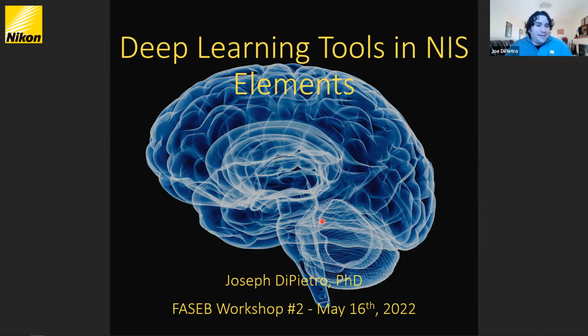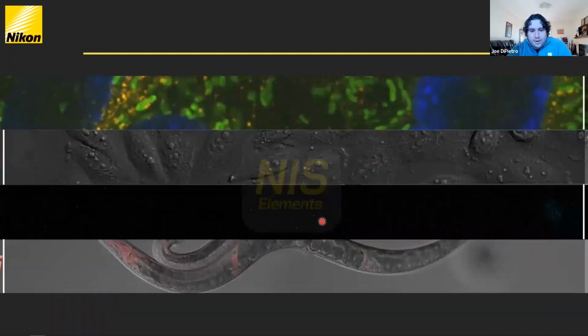All a large image is a bunch of small images. So if you just keep it as the small images, then you can do the analysis faster. And once the job is finished, it gives you that plate view. It kind of looks like a tiled image anyway. You know where the location of every image is, so that data is still there. Yeah. Cool. Anyone else? All right.